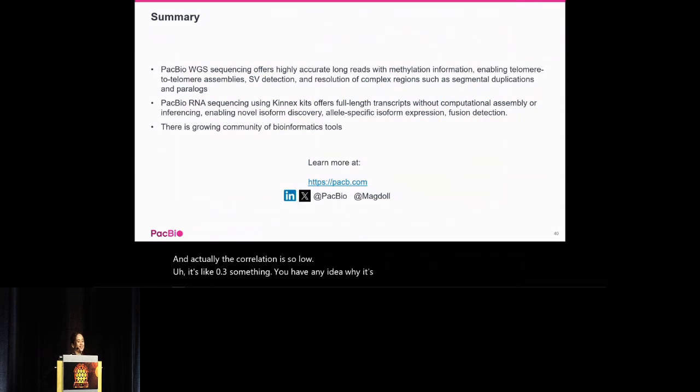Thank you. So they're both RNA-seq data. Yes, yes. That would be very highly unusual. I didn't include this slide, but we've actually shown that it should at least be 0.8 or 0.9. So we can talk about what went wrong. So you're getting high correlation. Yeah, we get high correlation in the WTC11 data set. So maybe we'll talk about what could have gone wrong. I would be very surprised.